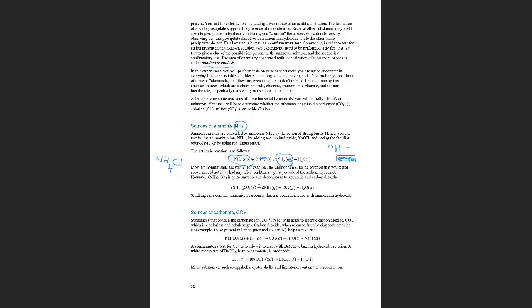With acids, the paper turns red, but with bases, the paper turns blue. You will see more about acids and bases in Chem 2. But for now, you will know that if you have ammonia, it will turn the red litmus paper blue. So these are two ways of detecting ammonia.